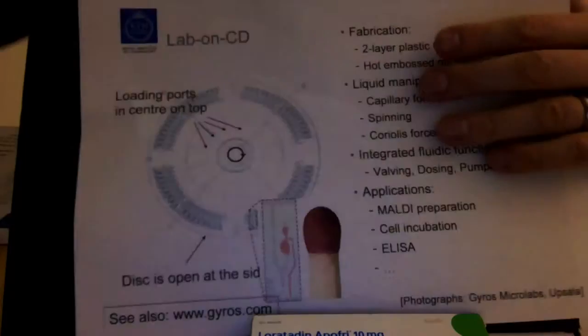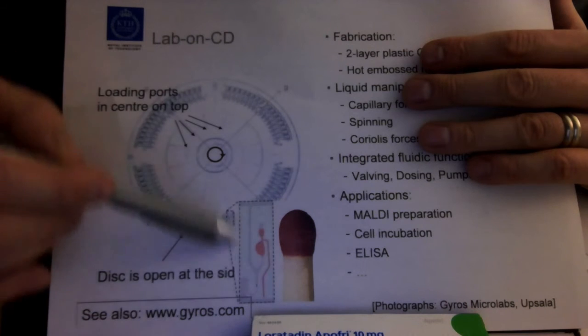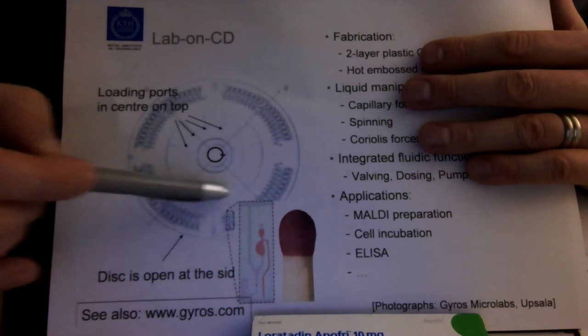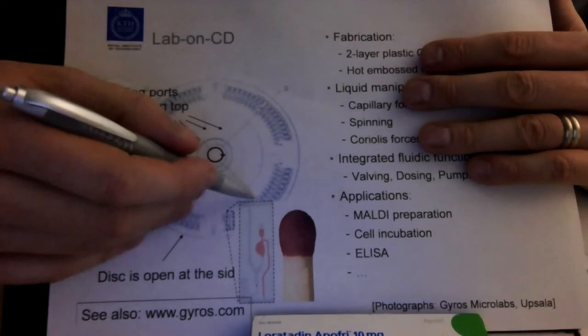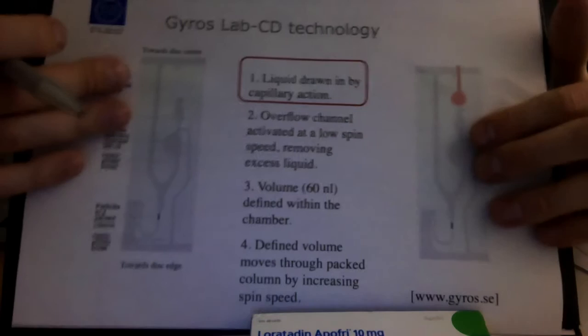So remember now the CD that we had here. Let's go first back, and now we're going to take one of these 96 different valves here, and we're going to look at a zoom in of here. So the middle of the disc will be towards here, and the edge towards here. Yeah? So now we look at the zoom in of the system here.